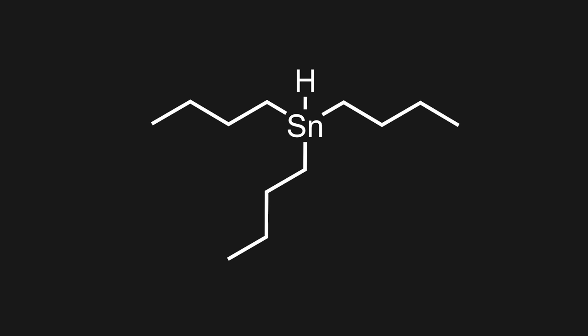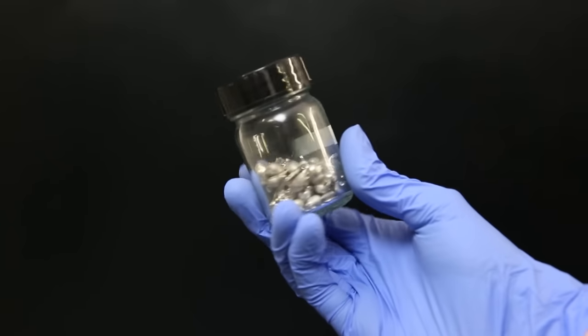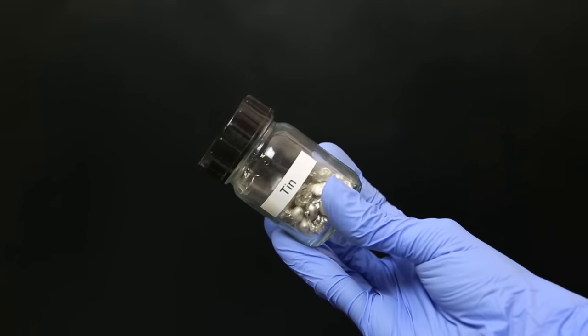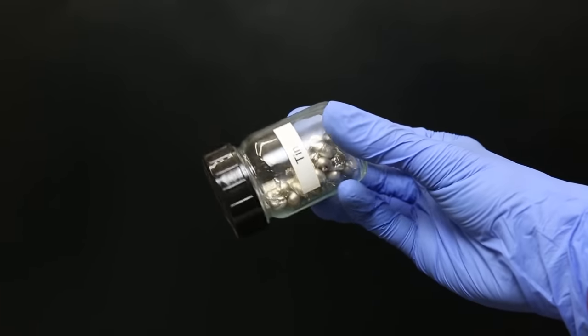Since I also want to explore some organotin chemistry, I will just be making it myself instead of buying it. Let's just get started and see how it goes. The tin I will be using are pieces that I made by melting a bar of tin and dripping it into a bucket of water.